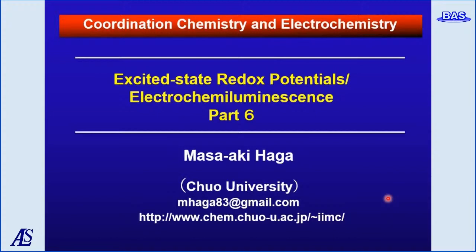I hope this seminar may help you solve any troubles and questions. Further, you should know new techniques to get new chemical information from a different point of view. Today, I'm talking about the redox potential in the excited state and electrochemiluminescence.